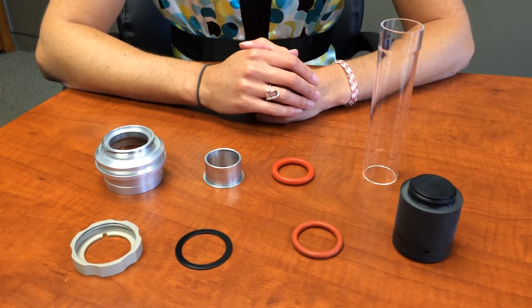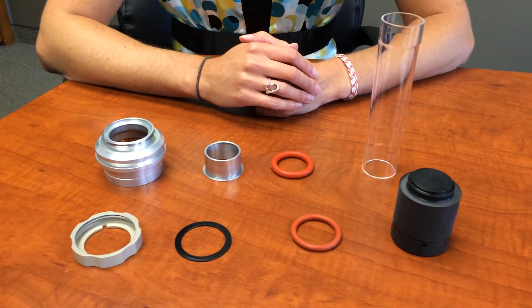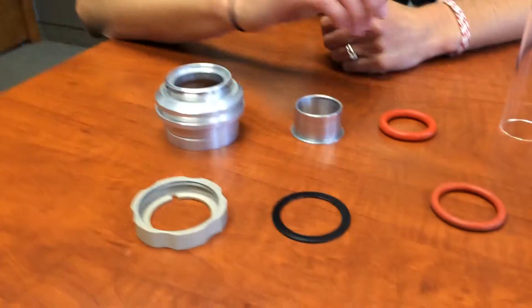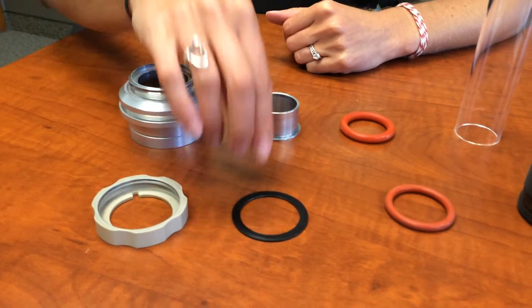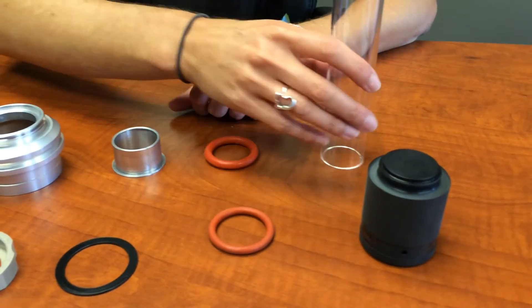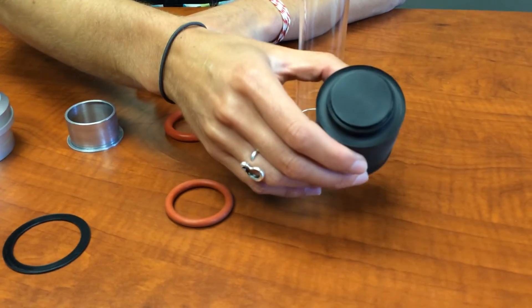This is the alpha replacement kit for the CS744 and 844 patented combustion tubes. One kit includes one metal insert, one plastic clip, two additional O-rings, one alpha version combustion tube, and one O-ring insertion tool.